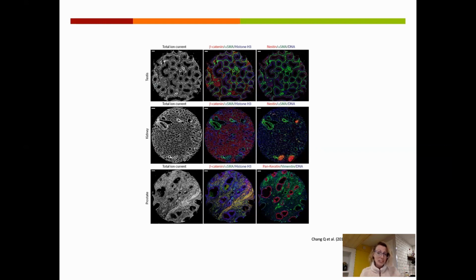Now, the one downfall is the human brain can really only interpret 3 signals at a time. So even though you might have 37 antibodies on there, you're still looking at only 3 in an image. However, when you start looking at the different sets of these, they're all still on that same section of tissue. So you can really recombine them any way you see fit. And the part that still totally gets me is how much detail you get in the tissue architecture of these, even though they've been laser ablated and then nebulized into nothingness.